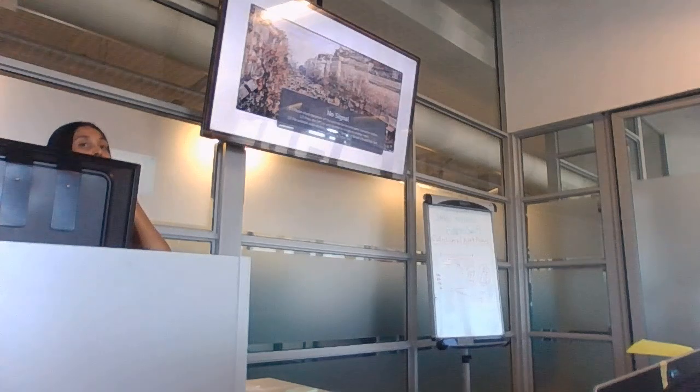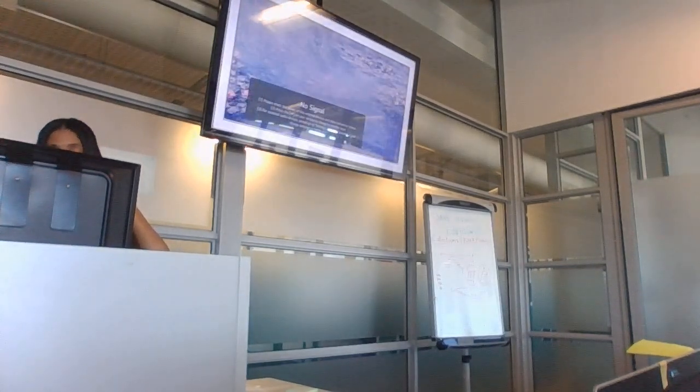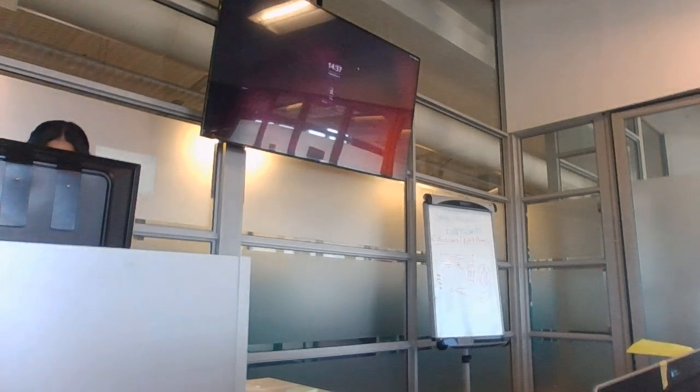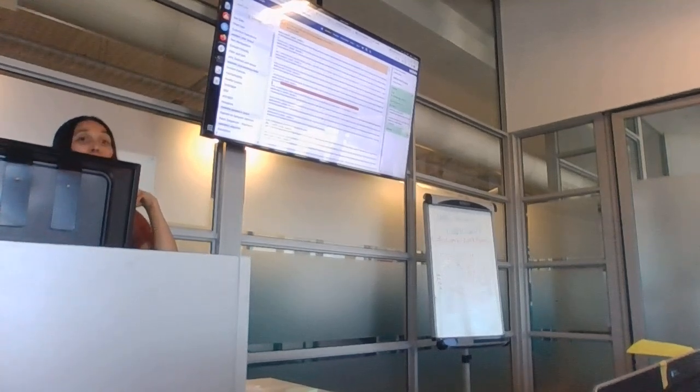In the summary of what we did, does the difference between collections and workflows make sense? And in terms of workflows itself, was there anything else that you had questions on, or that you needed me to demonstrate again? Anyone? Don't feel bad because you asked a question already. You may dominate the questions, it's perfect.